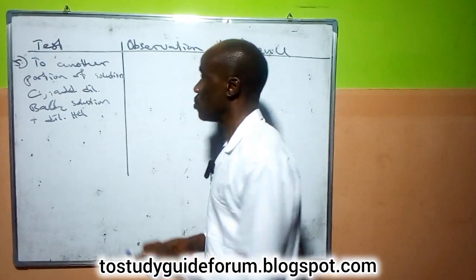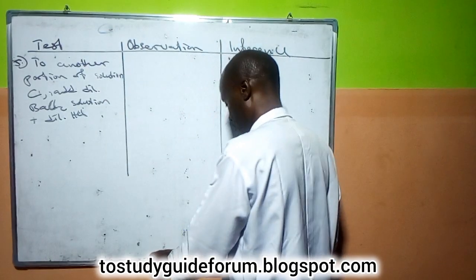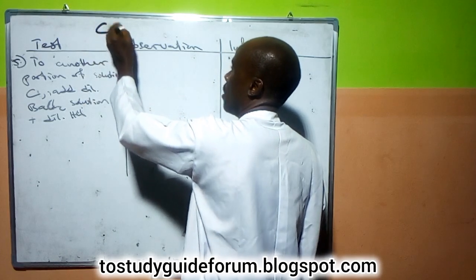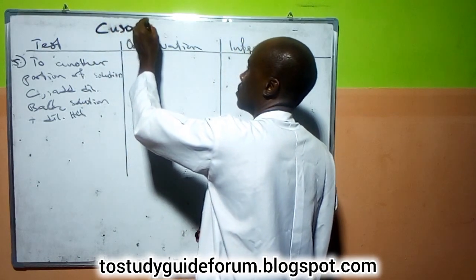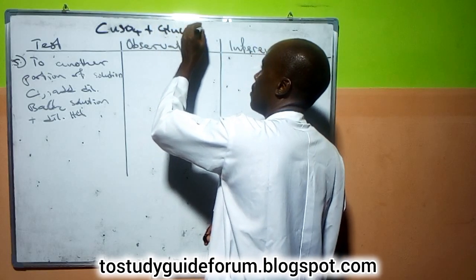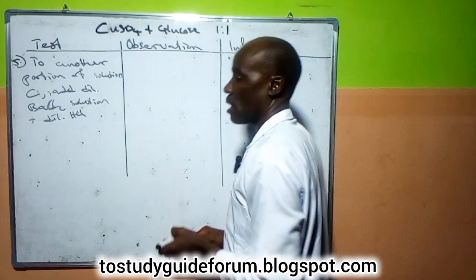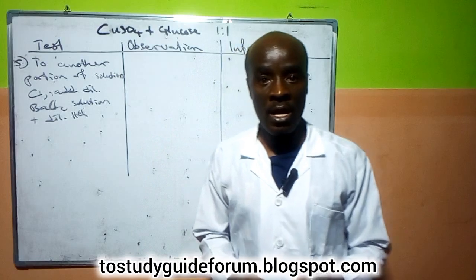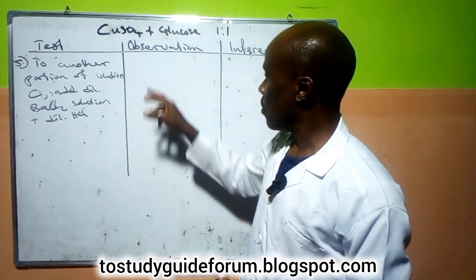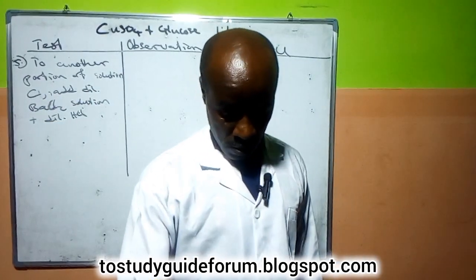Remember, like I told you earlier in the other half, what we have there is copper sulphate plus glucose, which I've already told you in the last video, which I'm going to measure up in a ratio of 1:1. Now, another ion that should be tested there is the anion, which is what I'm going to do now to show you how to do that test. I almost skipped this very test.